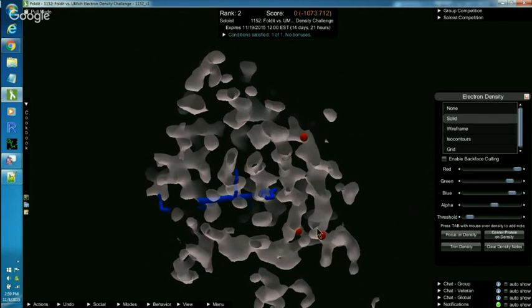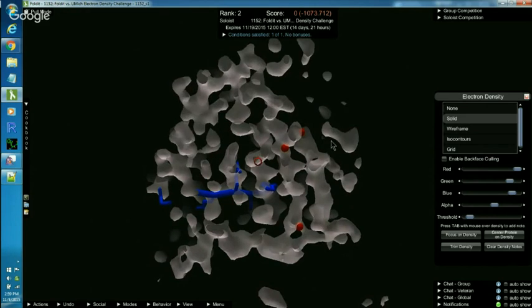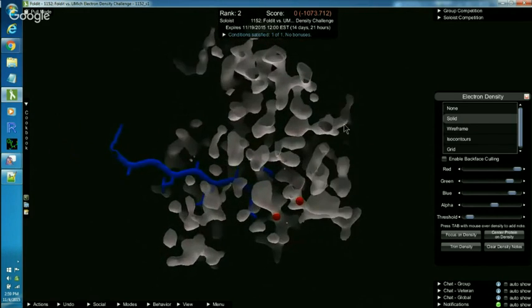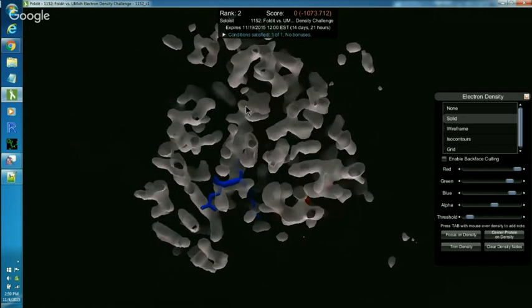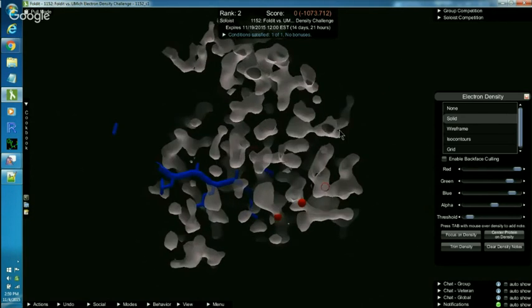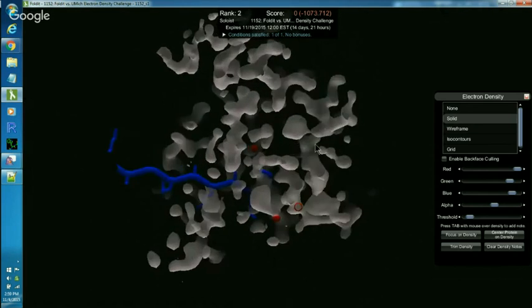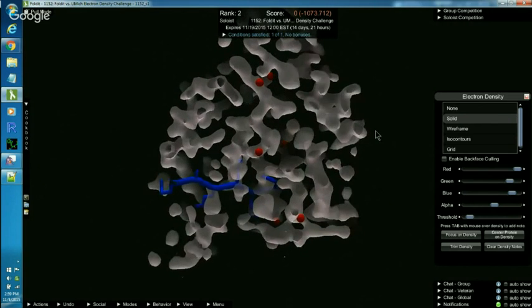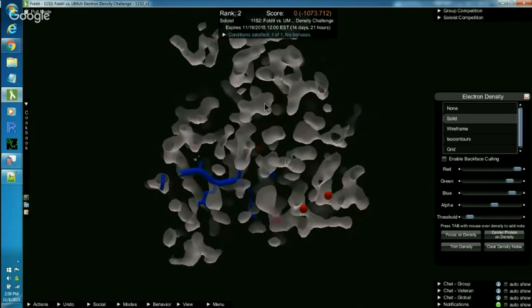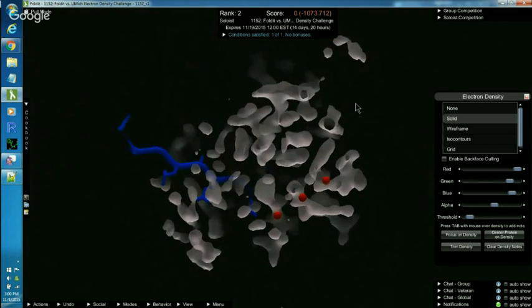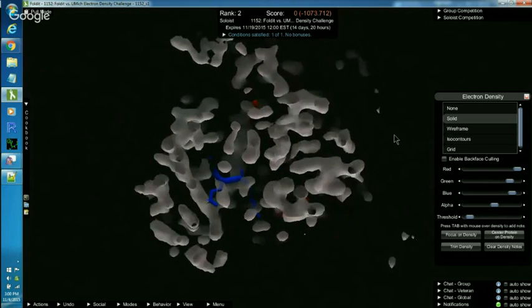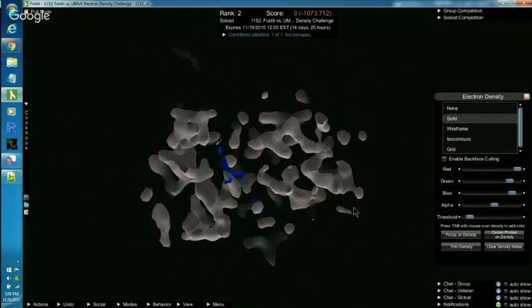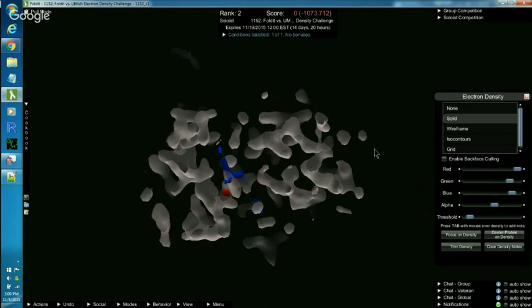So, I'm looking for these long, continuous, mostly straight sections that are parallel to one another. So, we've got one on the right. Let's go look on the left. I think I saw another one. There it is, going up and down. These are the two that I marked first and just to the left of them there's another one. Where does that one start? Maybe right here. And how far down does it go? They don't make a perfectly flat surface. The surface of a sheet is a bit twisted. So, that's why I'm having to roll them a bit to find them. This looks like the bottom of that fourth sheet.